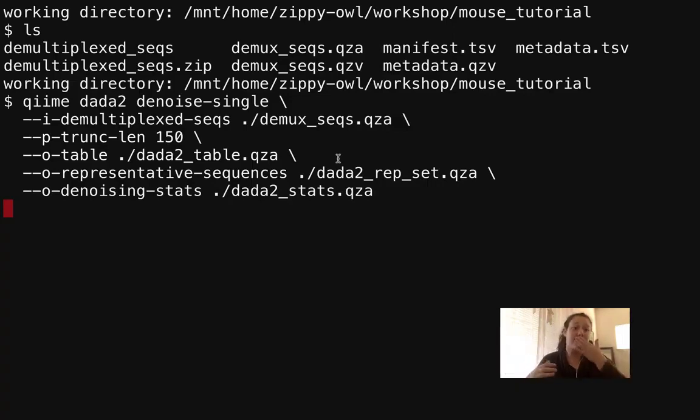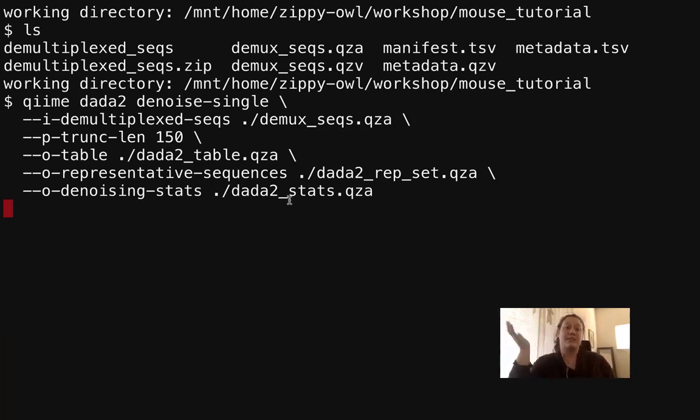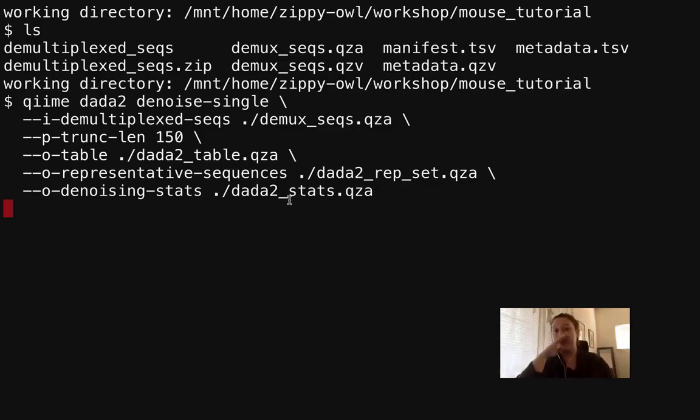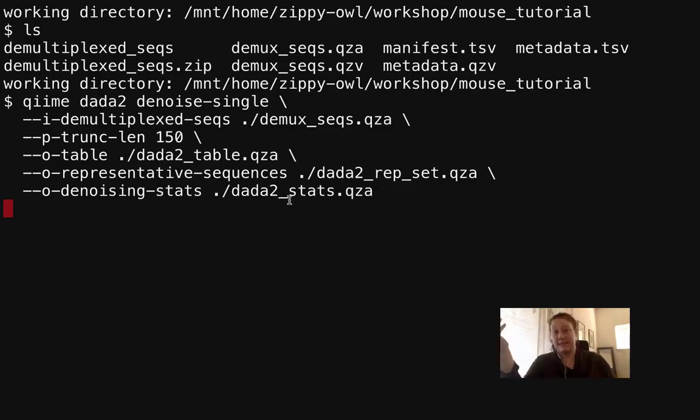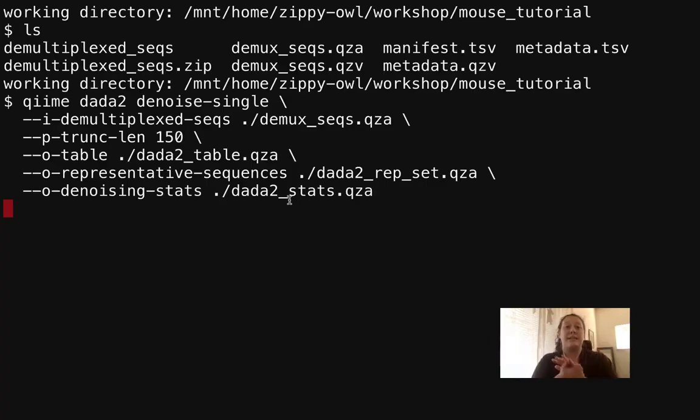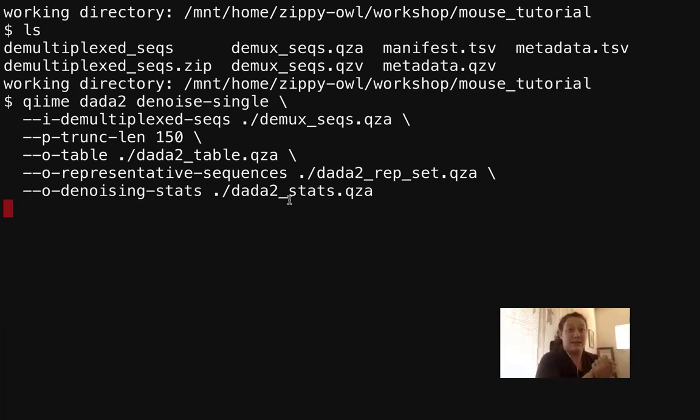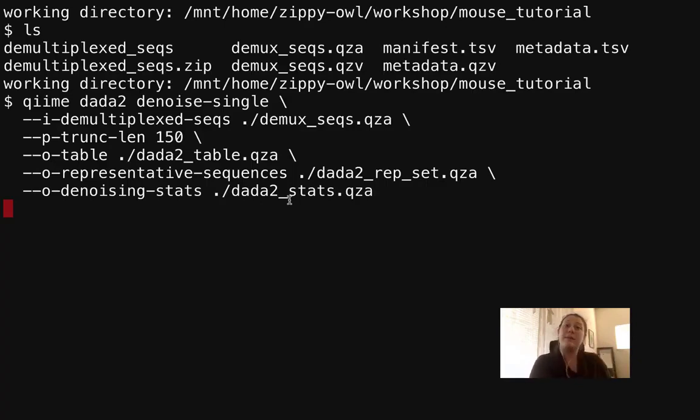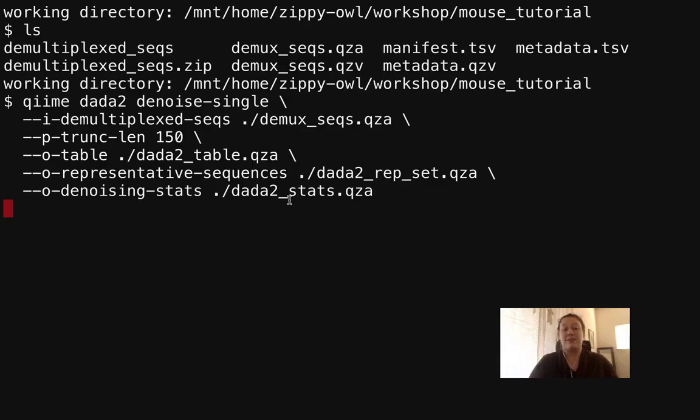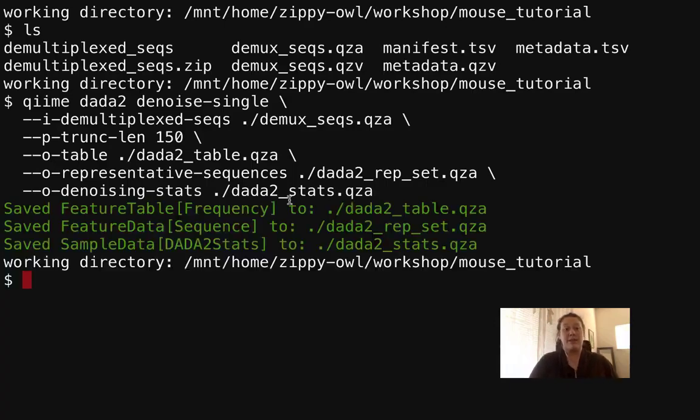And then lastly we will output denoising-stats DADA2_stats.qza, which basically tells us how the denoising step went. As you can see by our next step, we're going to do QIIME metadata tabulate on that DADA2_stats.qza. So that file is actually a metadata file. We'll use metadata tabulate to visualize it, and it can be used later on in the pipeline as a metadata file if you wanted to do that.